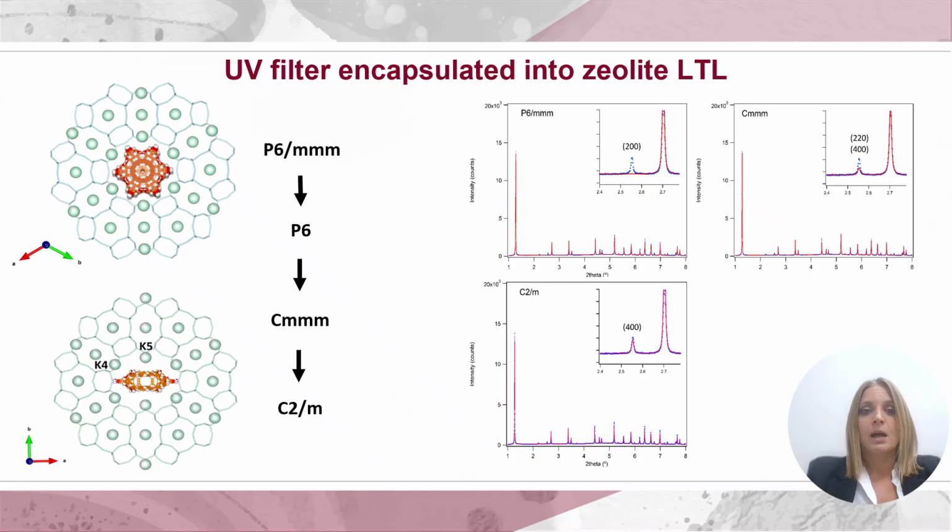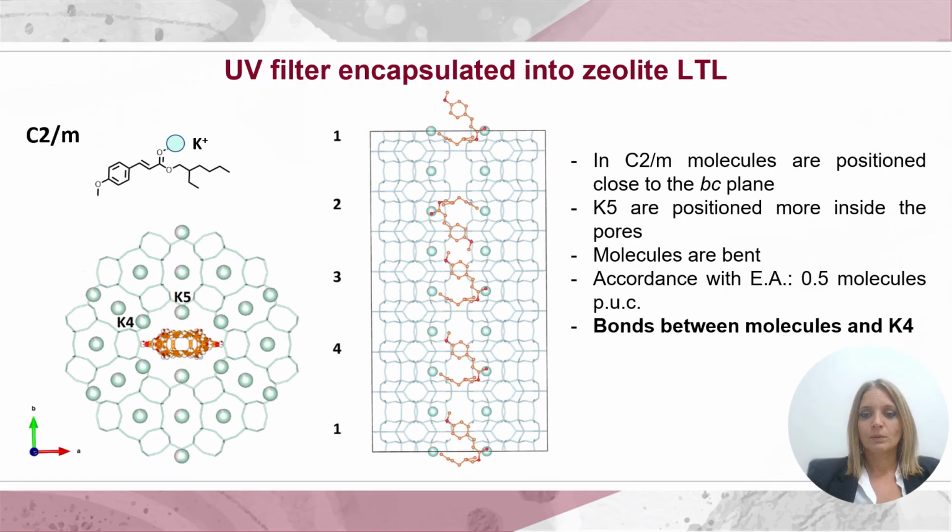And with the monoclinic space group C2/m, the fit improved, producing realistic thermal parameters and molecule counts, consistent also with the chemistry that we obtained through elemental analysis. Obviously, this proves that the insertion of the molecules inside subtly lowers the symmetry. We were then able to describe fully the structure of our hybrid material using the C2/m space group.